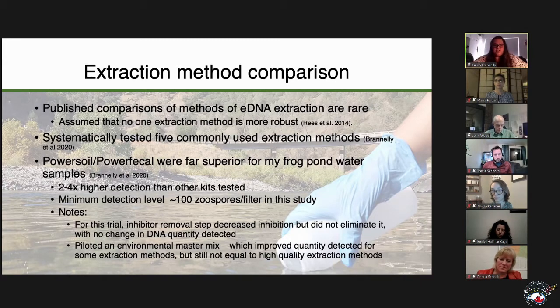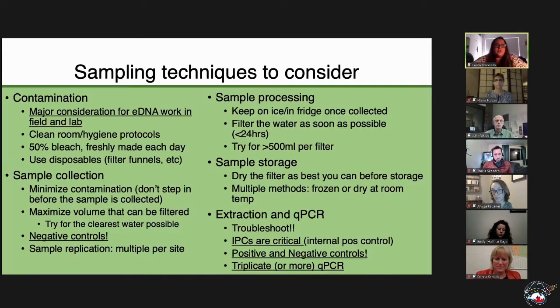Rather than trying to use the environmental master mix on a less sensitive extraction method. So here's some sampling techniques that you do want to consider when you're trying to do eDNA or construct a study that uses eDNA. One of the major things is contamination.